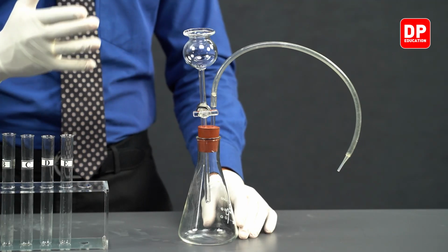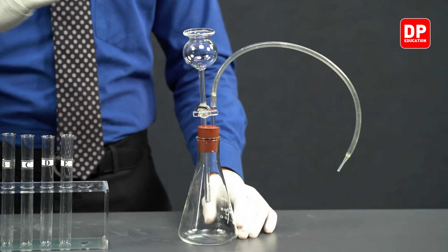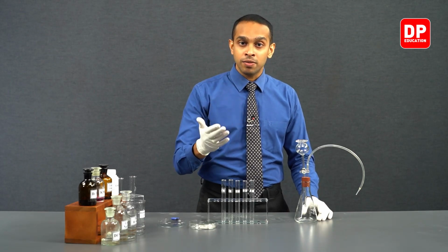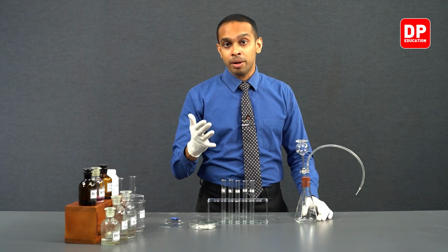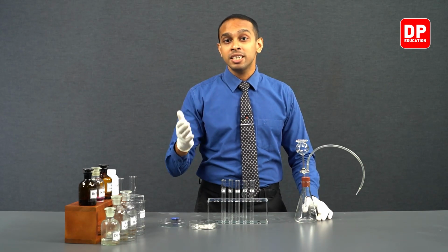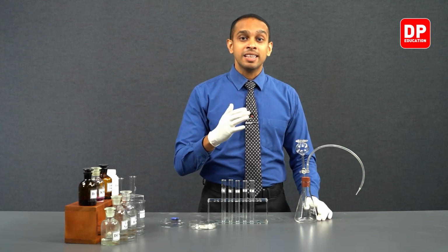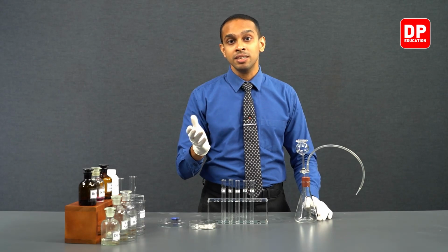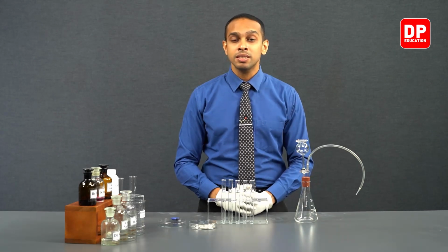This will allow the calcium carbide to come into contact with water in a well regulated manner, and it will allow calcium carbide and water to react with one another to produce acetylene gas or ethyne gas. These things do mean the same. Ethyne and acetylene are the same substance.